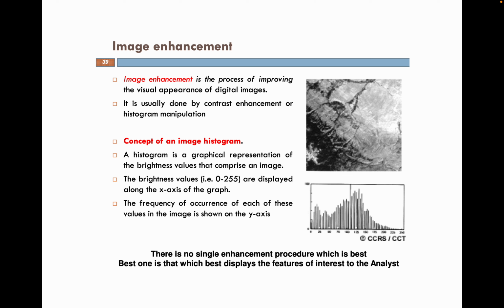And then you can make an image histogram, which has all the brightness values from 0, which is very, very dark, to 255, which is as white as can be. And you can see this sort of spread. And so you can then normalize this so that the brightest pixel is going to be 255.